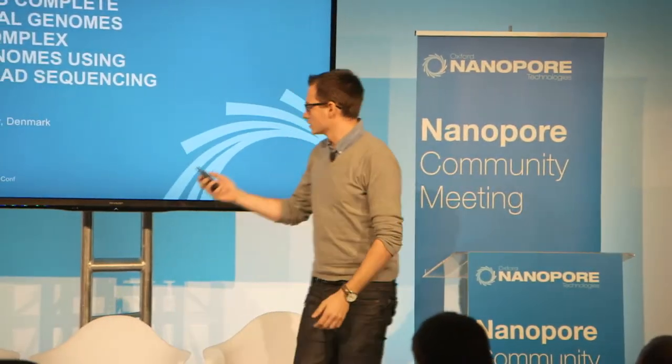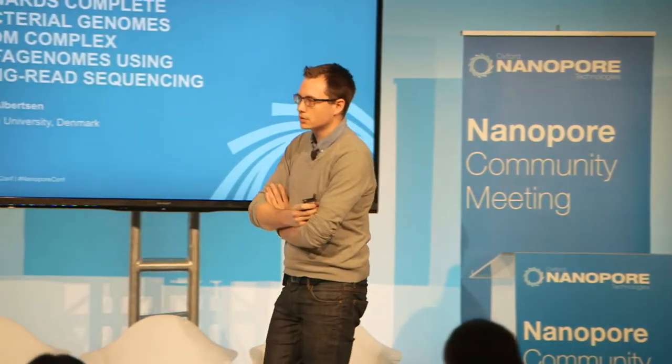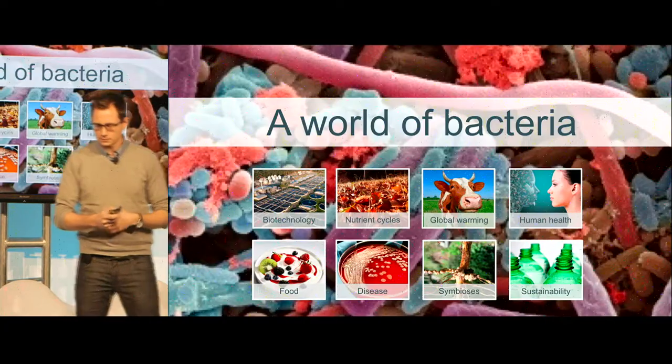up here. So yeah, I'm going to give you a progress update on how we are starting to use, I would say, high-throughput long-read data to assemble complete genomes from metagenomes.